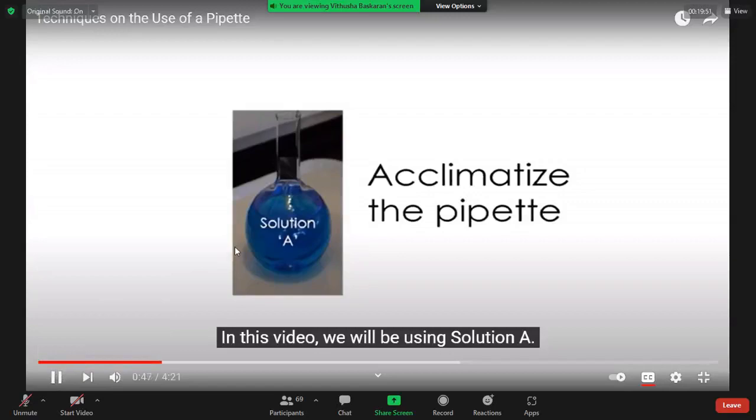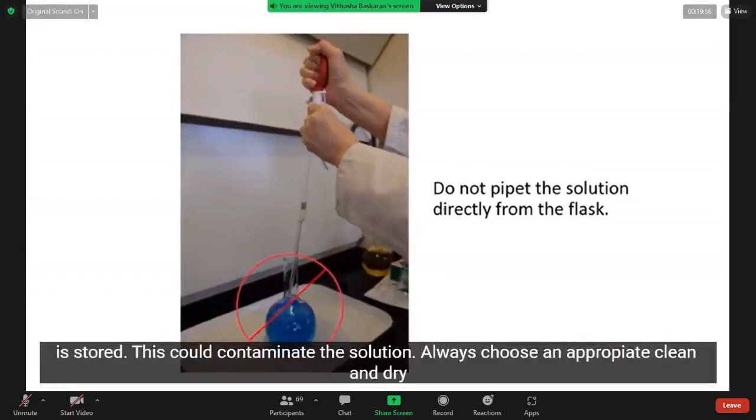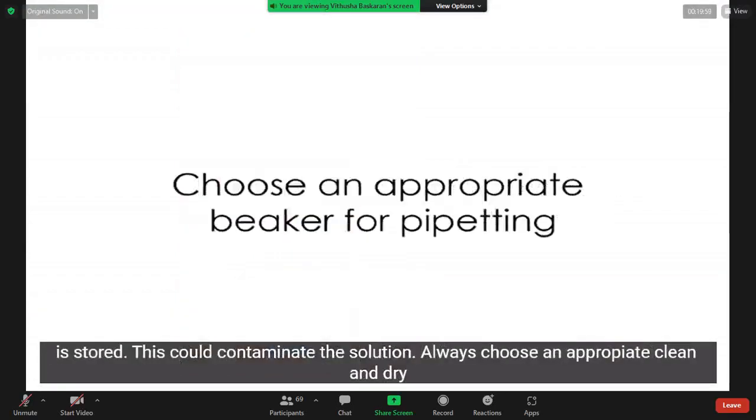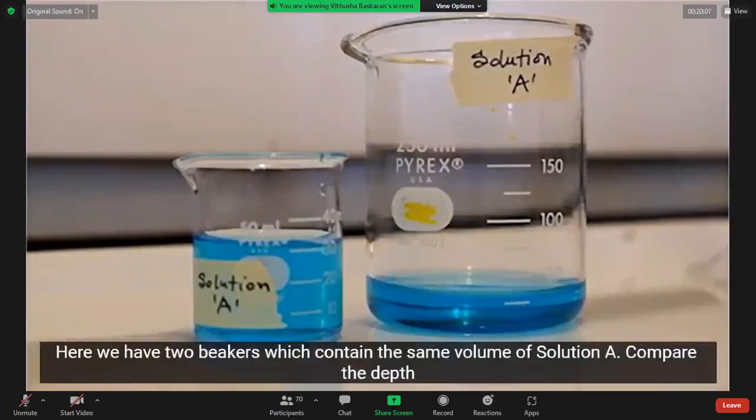In this video, we will be using solution A. When using the pipette, do not pipette the solution directly from the flask in which the solution is stored. This could contaminate the solution. Always choose an appropriate clean and dry beaker and pour a small quantity into a labeled beaker.